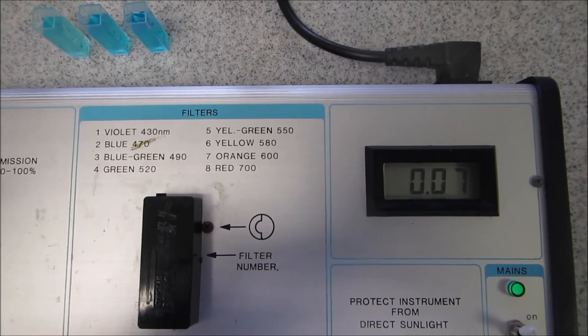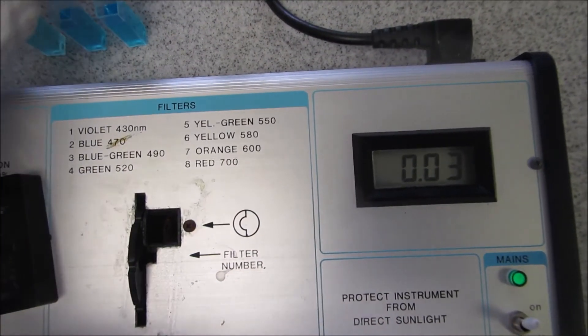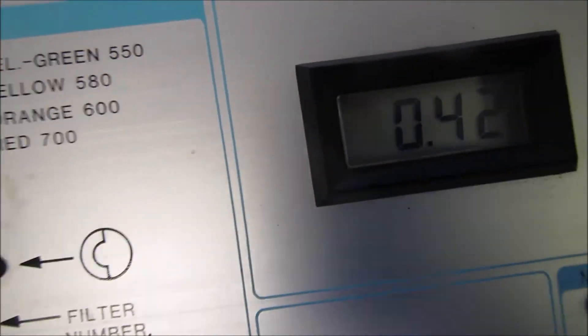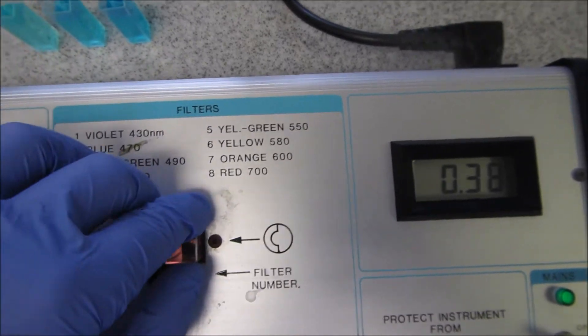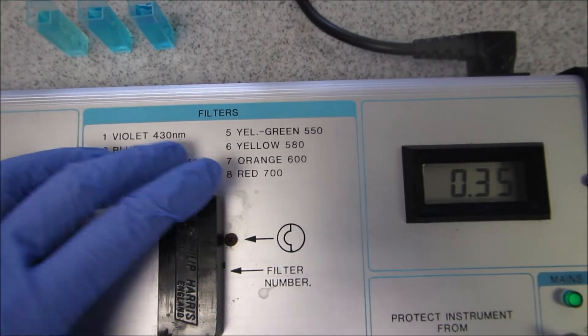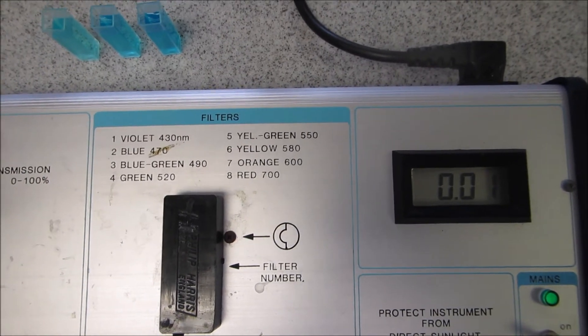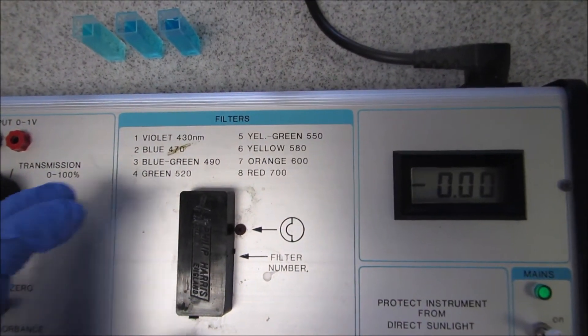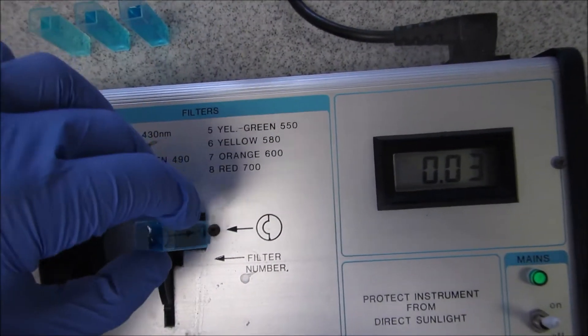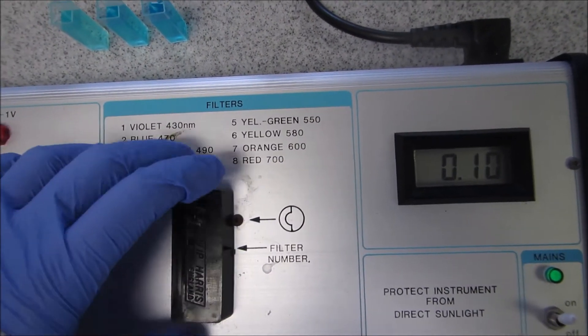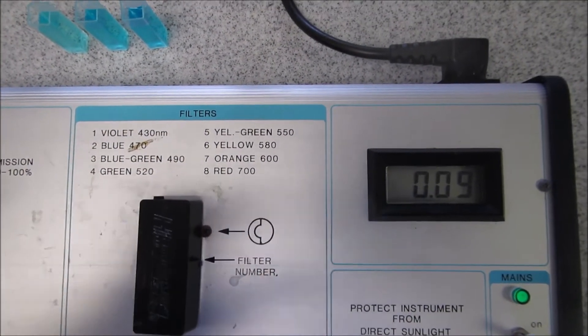I've blanked it, I'll now put in the copper sulfate solution, the 1 molar, and again that's the reading. It's still very low. Now I'm going to change it to wavelength number 4 which is 520 nanometers, put in the blank and zero it. Reading's getting a little bit higher but still very low.